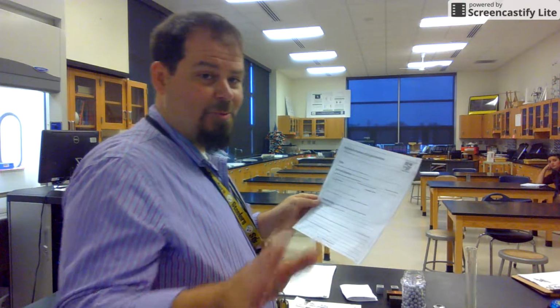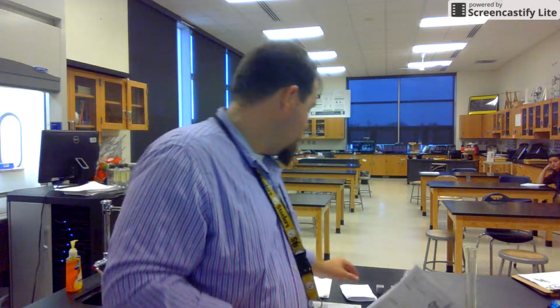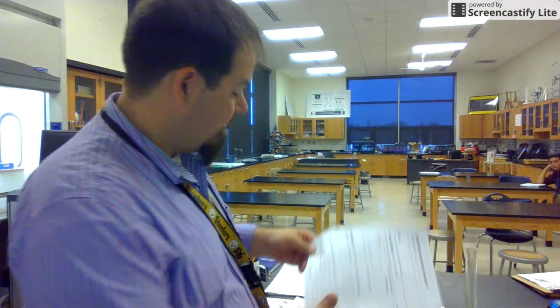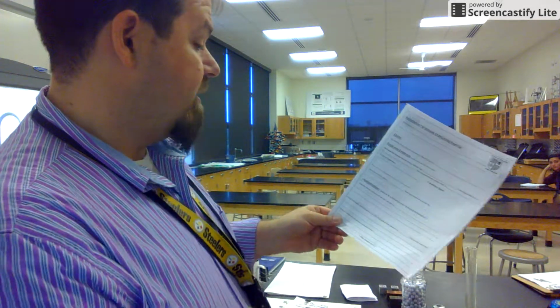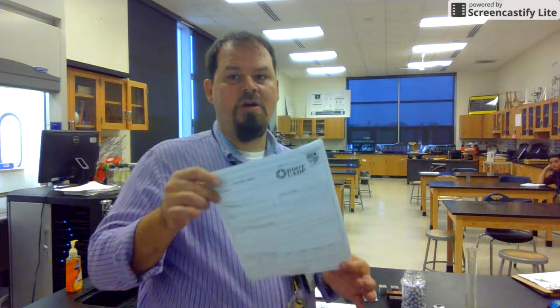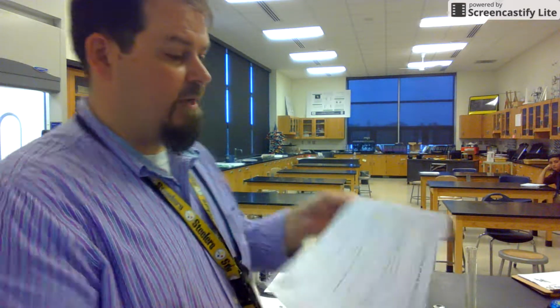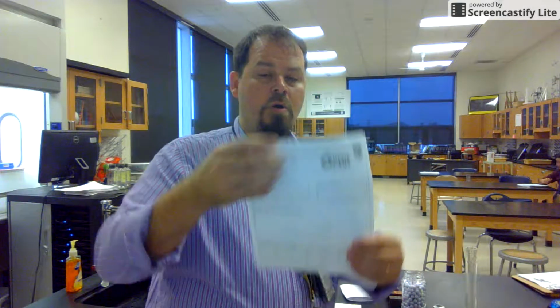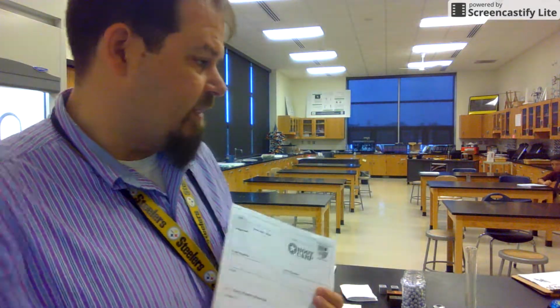Now here's where we get to think. Why on earth would the density of this metal be different than the density of the corresponding metal that is in your reference table? Think. Density is related to the identity of material because this is in the notes. This is part of the background knowledge that we just talked about. So I want you to think a little bit as a group and come up with some good answers and fill out your lab.